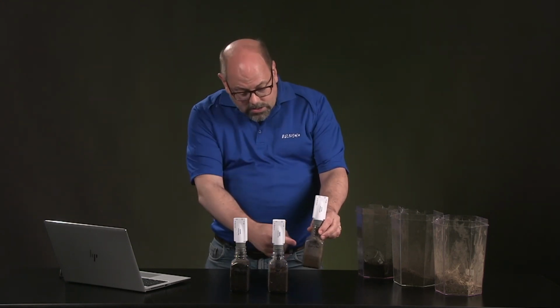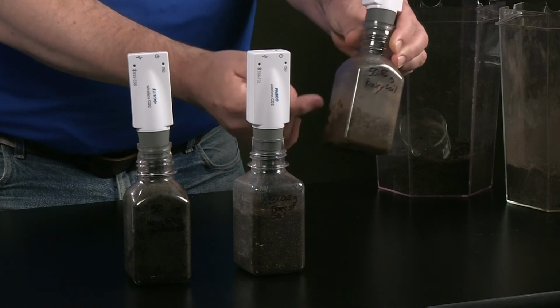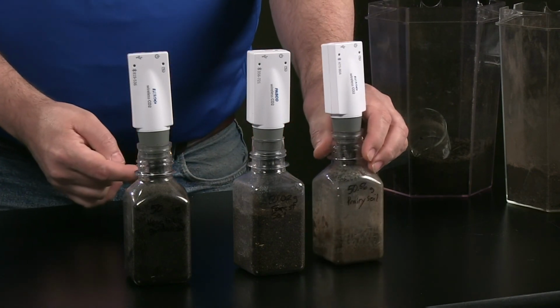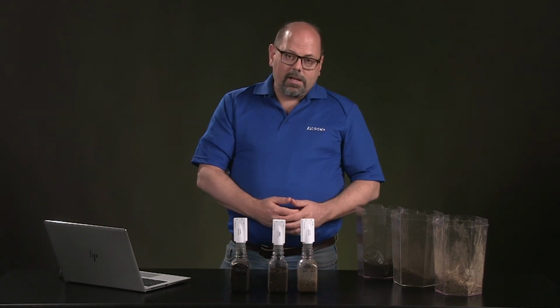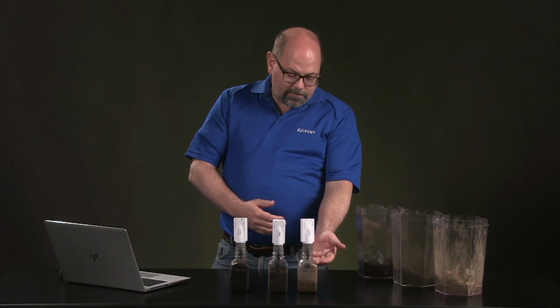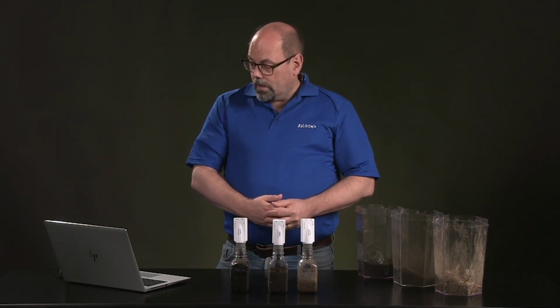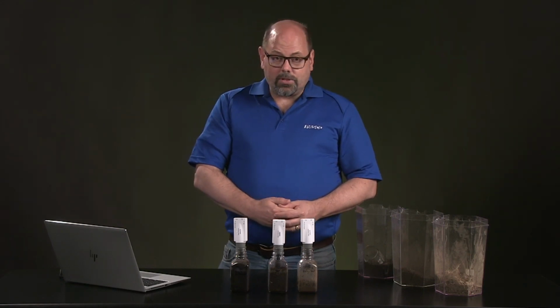One thing you might notice here is that there's a large space in between the bottom of the soil and where the detector is. So that may have made a consistent difference as well in terms of what the CO2 is, because the CO2 has to be generated and it's going to fill this before it starts to be registered inside of the detector. When you're all done, you've written up a short description.